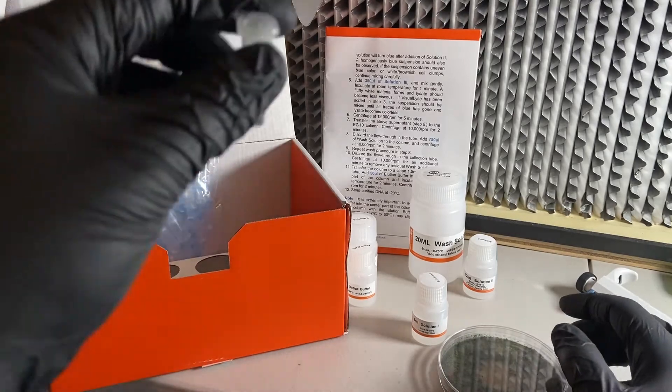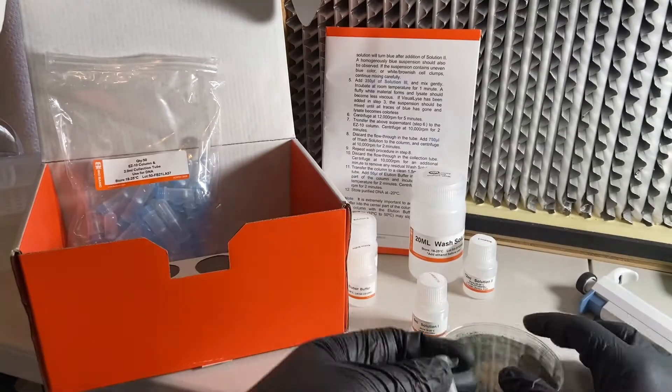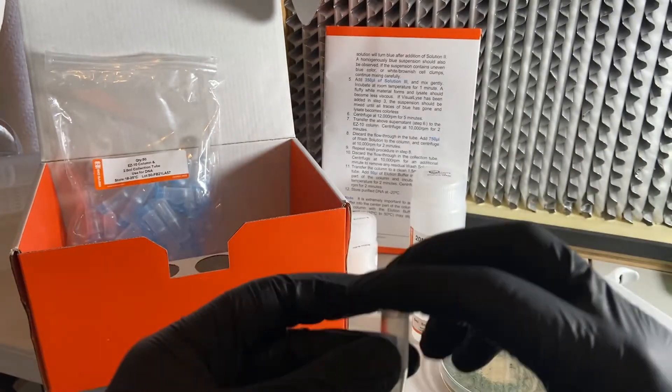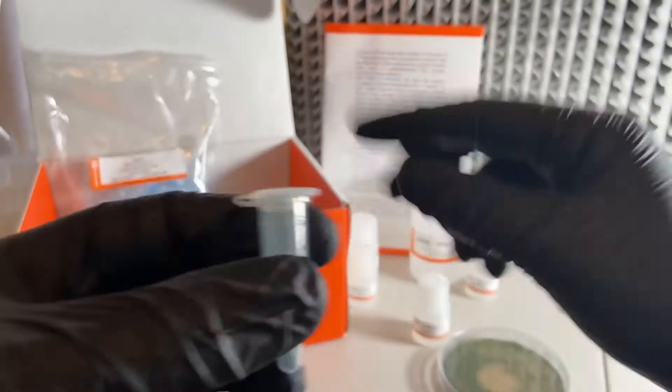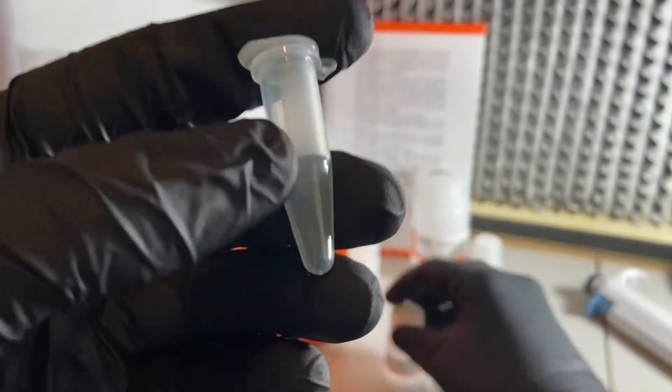This kit is really designed to purify plasmids from bacteria, but it turns out you can also use it to purify DNA out of spores that won't PCR, and then solve the issues that cause the PCR reaction to fail. The first step is scraping some of those spores into a tube and putting a certain amount of solution one into that tube.